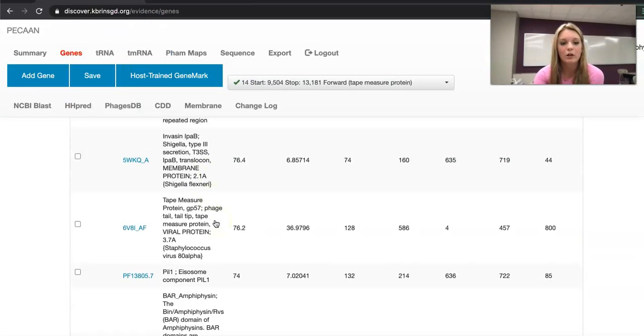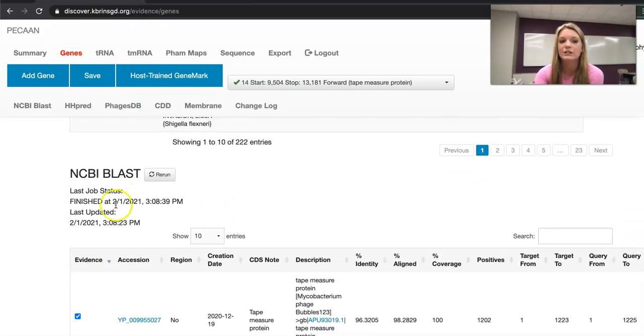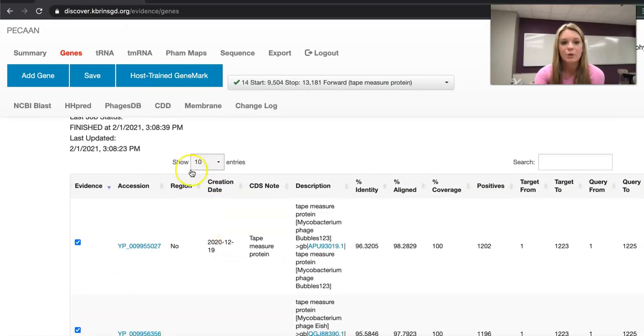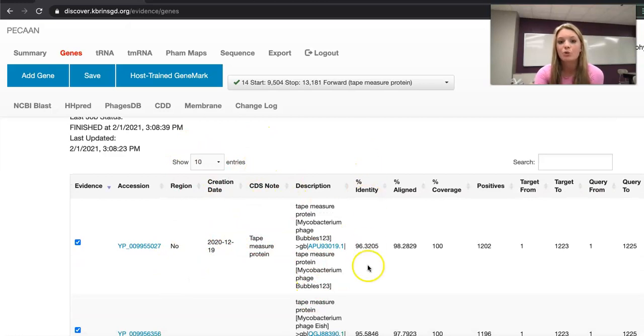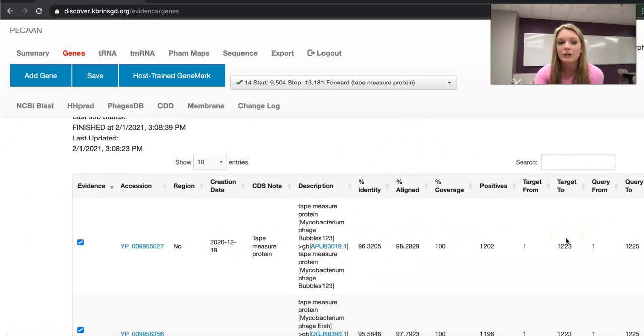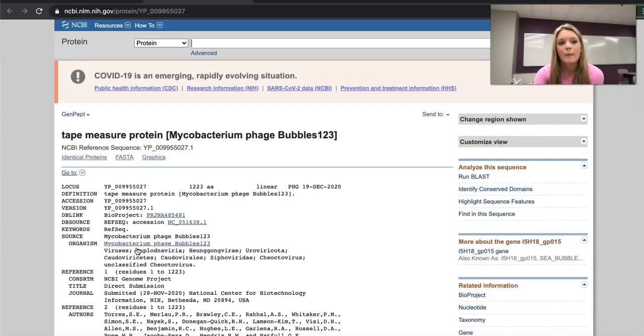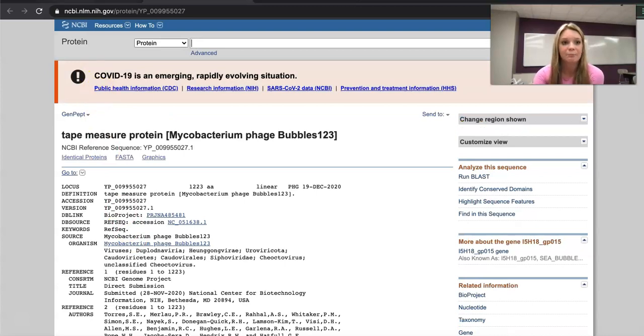Going back to Pecan, you scroll down a little bit further and you get to NCBI blast which gives you the region, creation date, notes, description, percent identity, percent align, percent coverage, and the e-value. You can take this accession and click on that link and it will take you to NCBI.